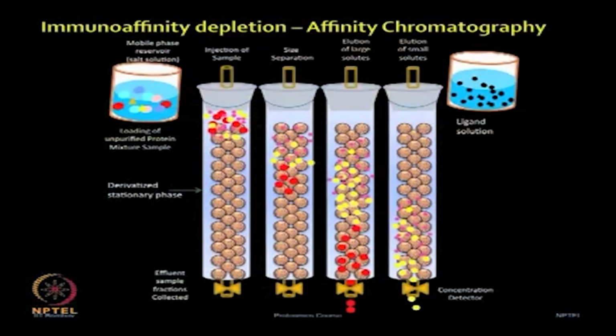As you are aware, and in fact we have discussed protein preparation from serum earlier, each biological sample poses a lot of technical challenges, and serum is one of them, where the presence of highly abundant proteins such as albumin and immunoglobulin results in masking of low abundant proteins.